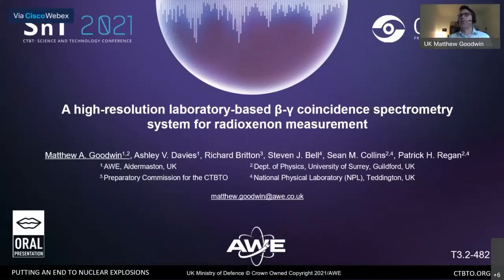Yes. Great. Okay, hi everyone, my name is Matt Goodwin. I work at AWE in the UK, and I'm based in the Noble Gas Laboratory, radionuclide laboratory GBL15. Along with my co-authors here, this is a talk on high-resolution laboratory-based beta-gamma coincidence spectrometry, particularly for measurements of radioxenon.